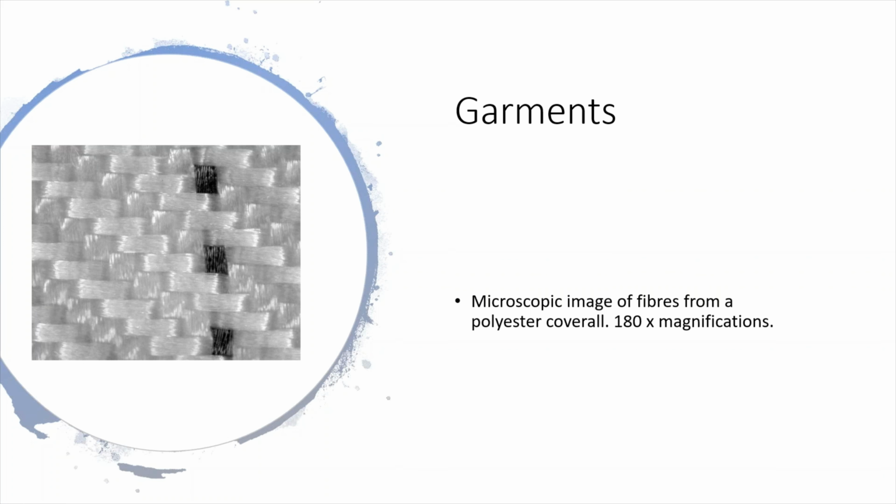And there's always going to be a balance between getting the maximal filtration efficiency rating and the level of comfort that the gown delivers. So the better the filtration efficiency, the poorer the comfort experienced by the user. And this is due to the rise in heat. So people often wearing certain gowns might become a little bit hot and bothered.